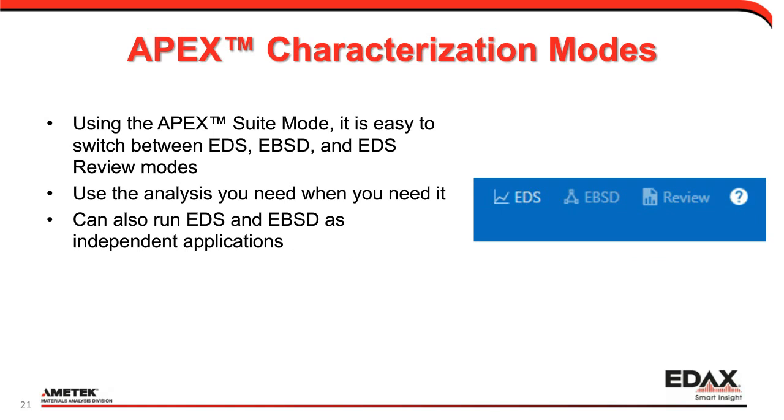And following that same theme, within APEX, we have our APEX Suite mode. So we have a button where we can run EDS, a button where we run EBSD, and then we have a review mode. And so we can switch from one to the other very easily if that's the approach you want to use, but also have the flexibility of only running EDS or only running EBSD as independent applications, depending on what works best for your workflow.